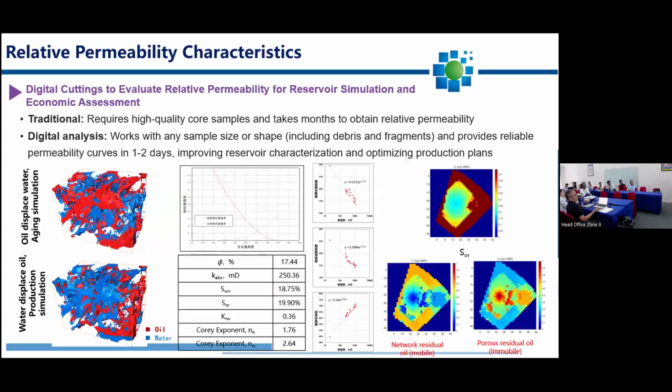This just shows some example of how we do the analysis. This shows the 3D image of the reconstructed sample, and we also inject fluid into the sample, then we can visualize the movements of the fluid through our sample. So that's what we use for calculating permeability.